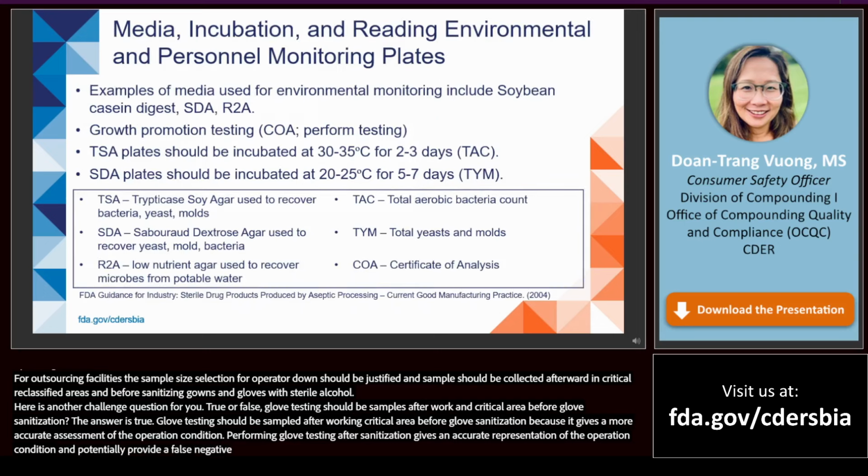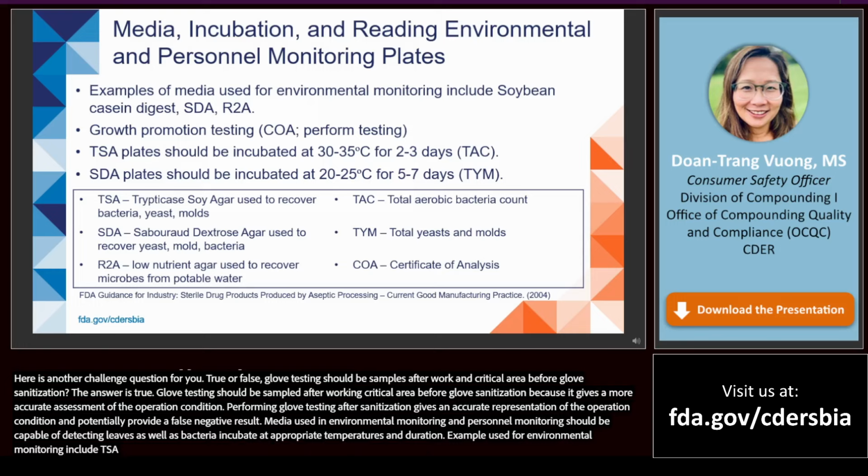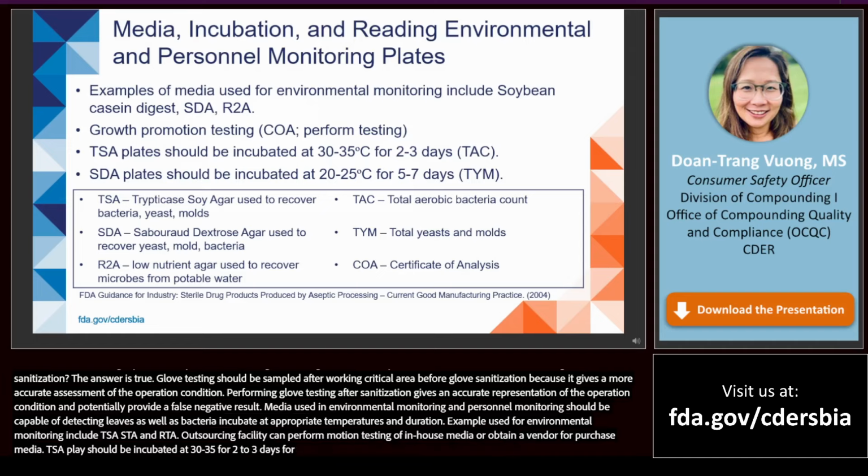Media used in environmental monitoring and personnel monitoring should be capable of detecting yeast and molds, as well as bacteria, when incubated at appropriate temperatures and duration. Example media used for environmental monitoring include TSA, SDA, and R2A. Outsourcing facilities can either perform growth promotion testing of in-house media or obtain the vendor CofA for purchased media. TSA plates should be incubated at 30-35 degrees for 2 to 3 days for total aerobic bacteria count, and SDA plates should be incubated at 20-25 degrees for 5 to 7 days for total yeast and molds.